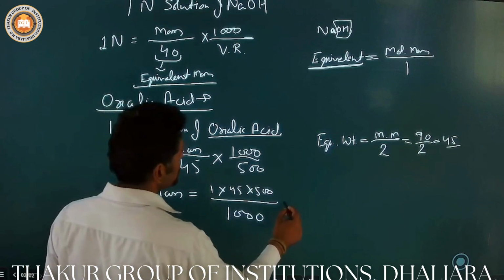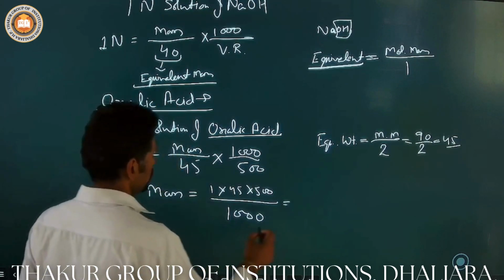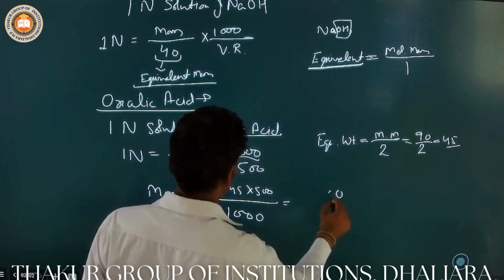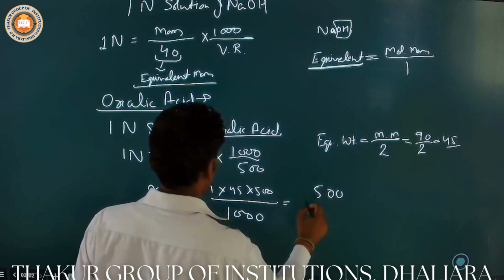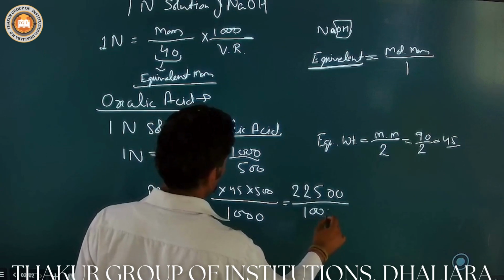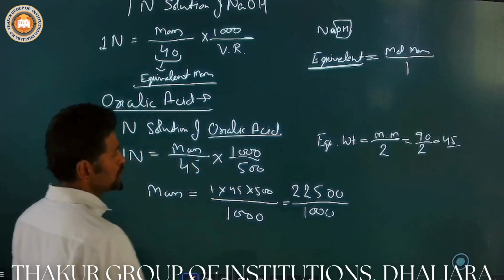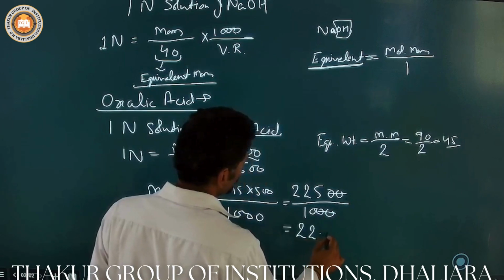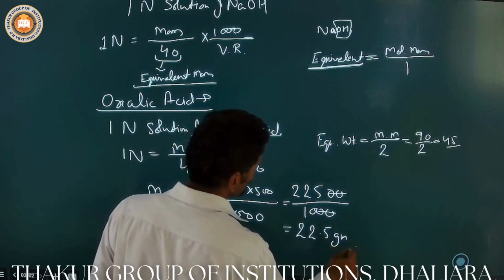By solving this, the weight comes out to be 22.5 gram.